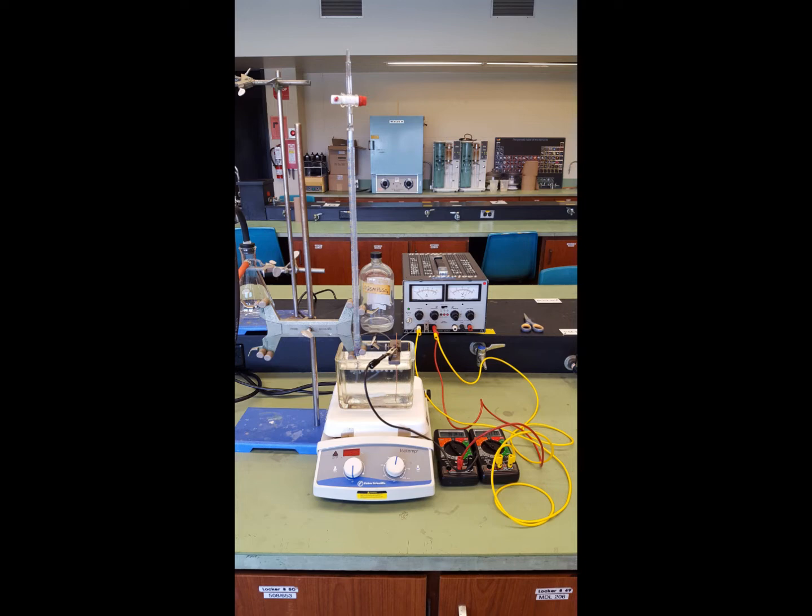And so this gray insulated wire, it's copper wire, it has gray insulation. The insulation is peeled away at both ends, enough to make an electrical connection to the power supply at the negative terminal, and the other end that sits in the bottom of the burette has about 2 inches of the insulation peeled away. And then untwist the copper wires, spread them out so that there's more surface area. And the end of that wire goes into the bottom of the burette. So it's completely immersed in acid.